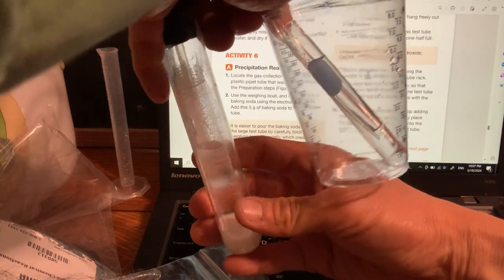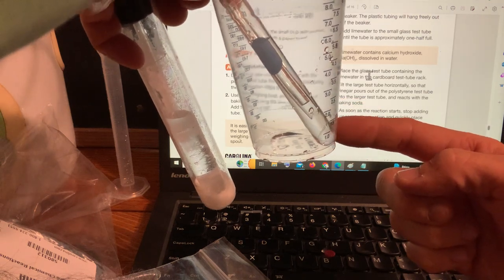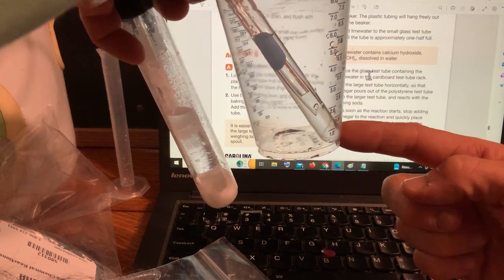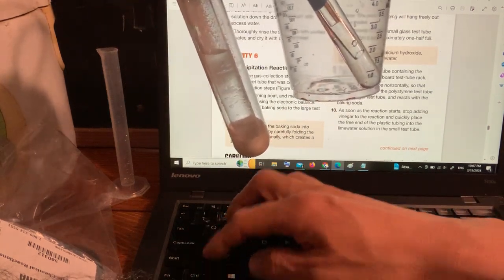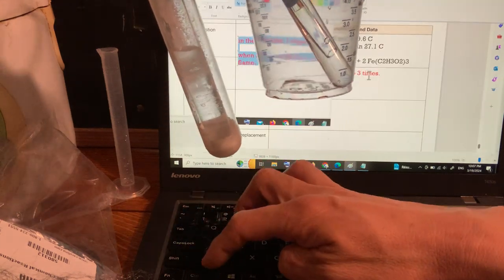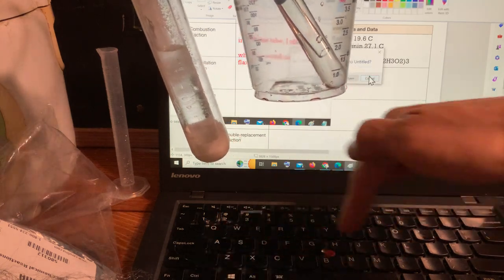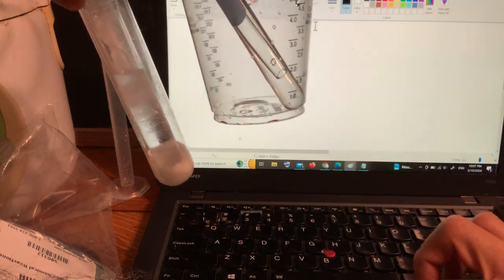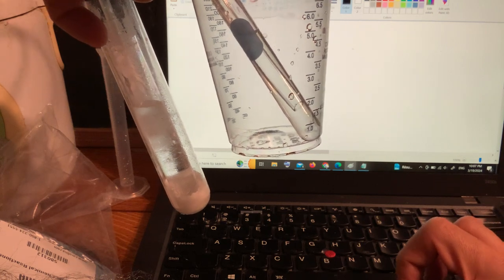then calcium carbonate will form in here. Carbon dioxide plus calcium hydroxide makes calcium carbonate. So if this works, calcium carbonate will form. Let me get a background so we could see any cloudiness, if we're going to get cloudiness. I'm not at all sure that we will get cloudiness. Okay. I want to paint this black. Okay, good. Here we are.